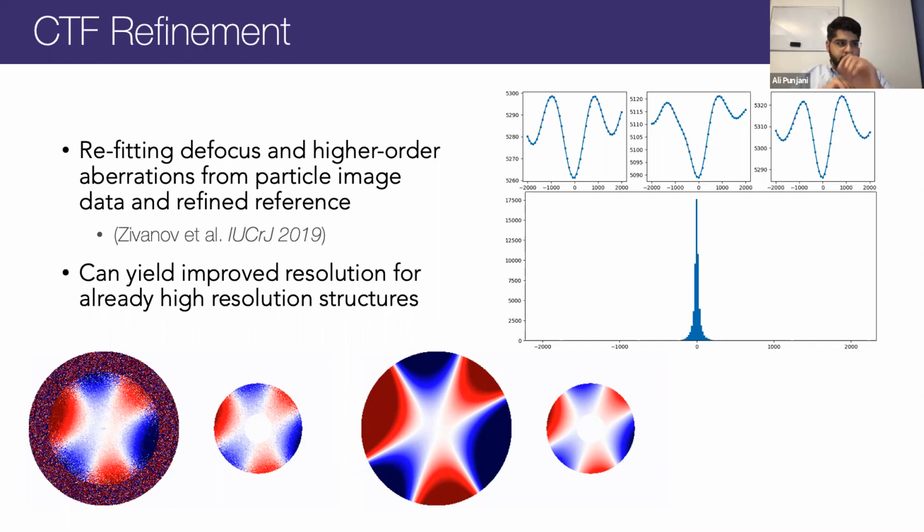Refining the defocus of an individual particle can be very important, and especially for higher resolution and more rigid proteins, it can make a world of difference because it can directly account for the position of each particle within the ice. With patch CTF, we're only able to estimate a defocus landscape. So different parts of the ice can have a different defocus value, but at one position, two particles can't be at different heights in the ice, according to the patch CTF model. But when we refine individual defocus parameters, each individual particle can have a different position in the ice. And if the particle is big enough and there's enough signal in the images, we can do that quite well. That can yield significant resolution and map quality improvements.